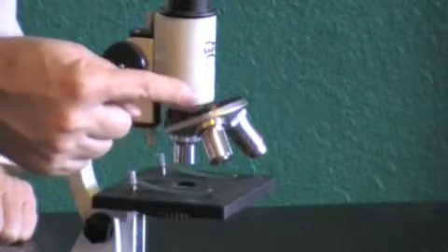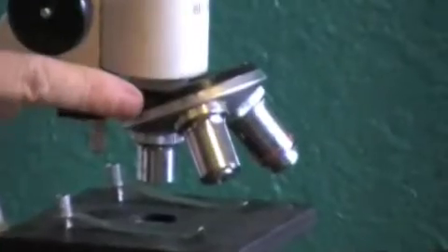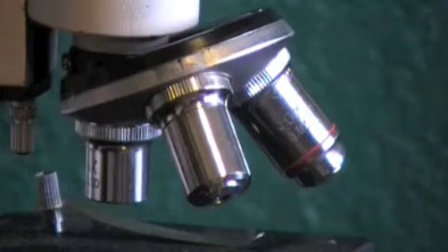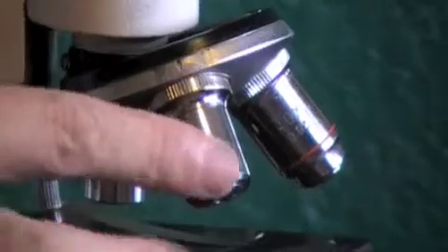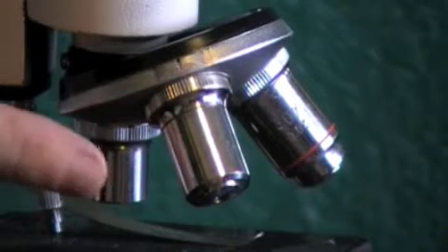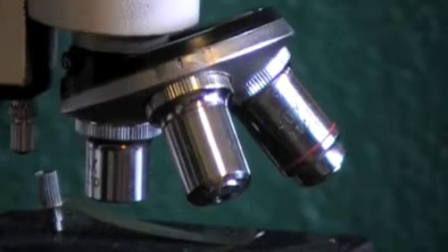Down here, you have your revolving nose piece. Now your revolving nose piece has on it three different objective lenses. You have a scanning objective lens, you have a low power objective lens, and you have a high power objective lens. The scanning one is the shortest one. It's a 4 times power on that one. It's your shortest lens. That's the one you're going to use when you put a slide on here.